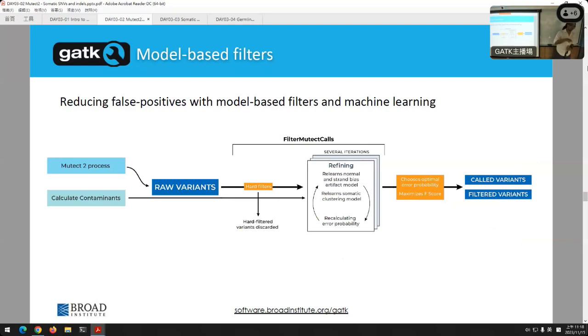What if I make another tweak over and over, using different aspects of it, until we finally have confidence that there are no obvious changes we can make that'll make the overall confidence in the call set higher. This is the last step of refinement that will help us figure out what other bits of it we have to cut away so we are confident in the whole. It will also cut down the set of variants that we actually have left, though. But that's okay. We'd rather undercall than overcall in this particular case.